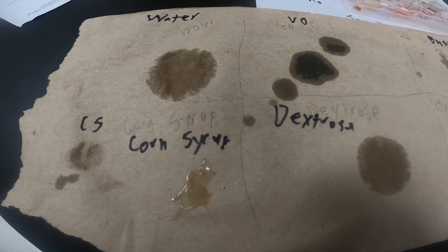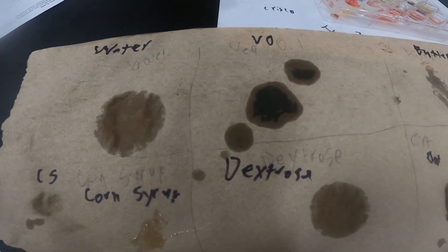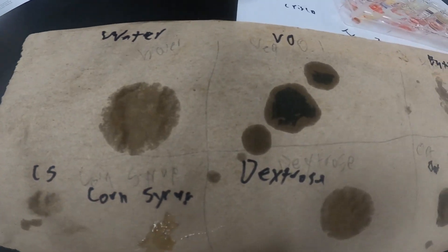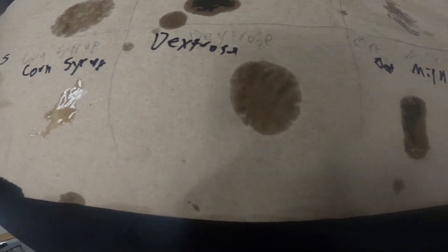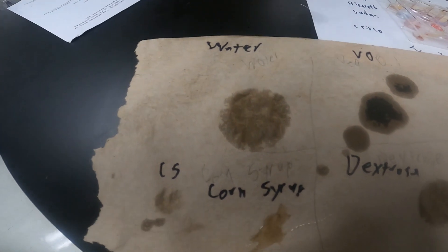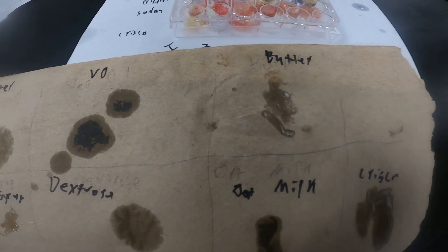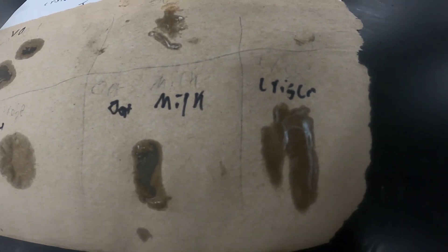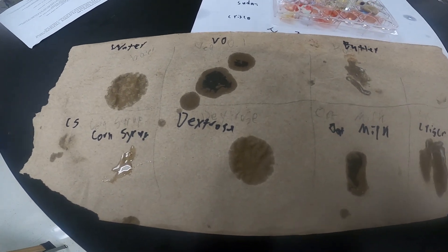With this test we're looking to see whether it leaves a grease stain behind. The vegetable oil is definitely leaving that stain while our water is starting to evaporate, especially along the edges. Butter appears to be leaving a light stain. Corn syrup doesn't really seem to be leaving much of a stain — negative. Dextrose looks very similar to water, so no stain on that one either. Oatmeal looks a lot more similar to our vegetable oil, leaving that stain behind, along with our Crisco. So: negative for water, positive for vegetable oil, positive for butter, negative for corn syrup, negative for dextrose, and positive for oatmeal and Crisco on our lipid brown paper towel test.